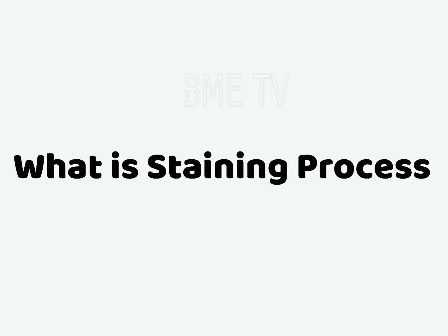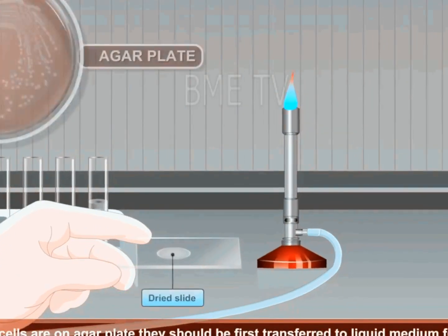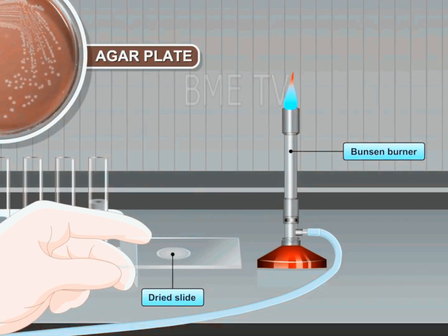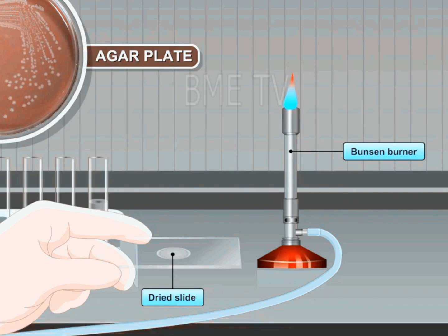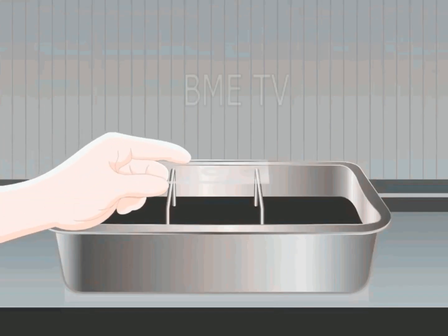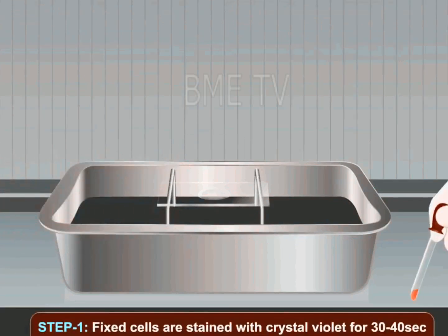Microscope cell staining is a technique used to enable better visualization of cells and cell parts under the microscope. By using different stains, a nucleus or a cell wall is easier to view. Most stains can be used on non-living or fixed cells, while only some types of stain can be used on living cells. Cells are primarily stained to enhance visualization of the cell or certain components. Cells are sometimes also stained to highlight metabolic processes or to differentiate between live and dead cells.